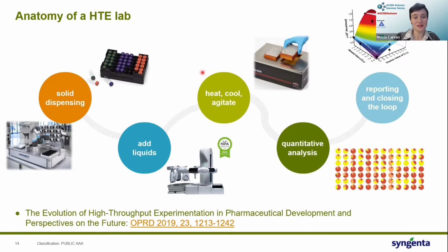What's important here, from my perspective, is making sure that this workflow is data driven and that we think about data at every step of the way. I like my Python script, even though it's written by me, not a real software developer, because when I design my plates, it gives me all the inputs and it gives me a template ready for the output of the LCMS to be put straight in there. And it kind of just guides me throughout the whole process. And that's probably the most important part of data management for the experiment that I'm running right now today.